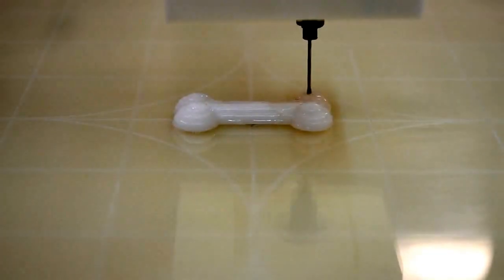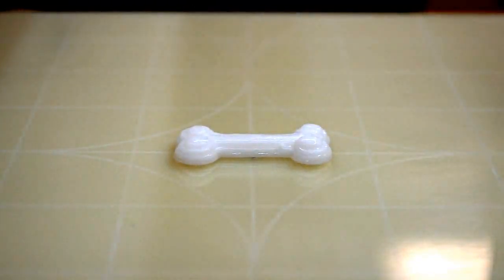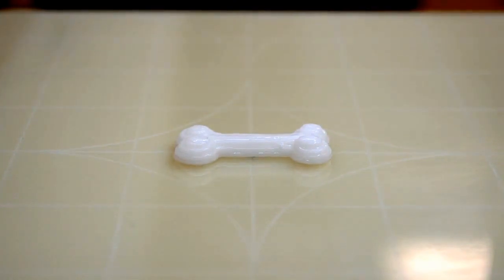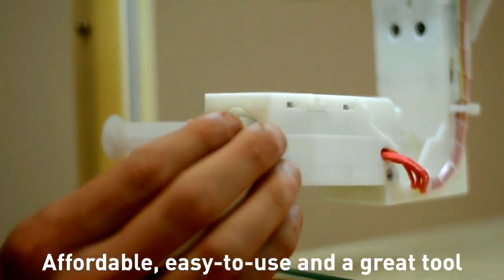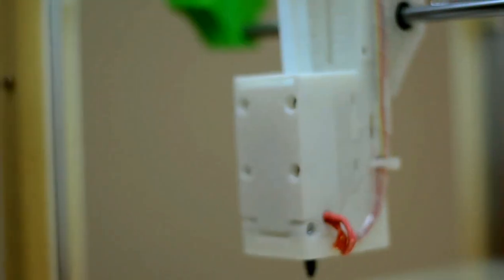The possibilities for the 3D bioprinter uses are endless. REBEL is affordable, easy to use, and a great tool for active learning.